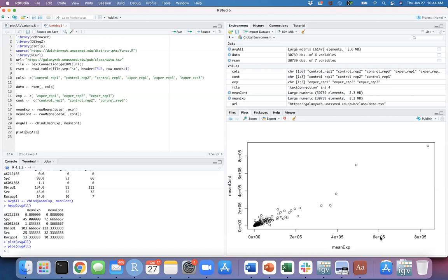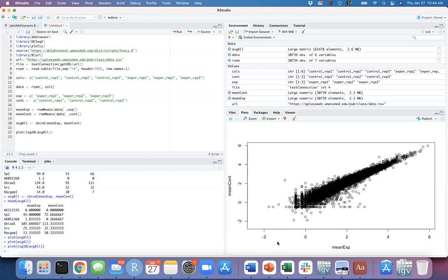It's going to go down like this. So if you do log 10 or log 2, it's going to be different. But let's do log 10, for example, just to see what happens to the X and Y axis. So basically, you can use this log 10 function here and do it like that. And it's going to be how we want. See, 6, there's 5, 4.